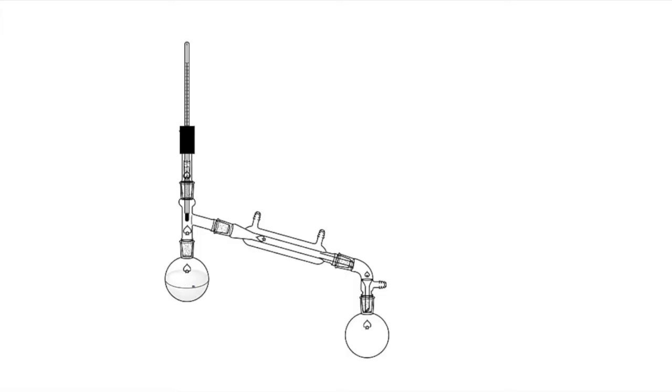So we begin with the liquid here. In our lab, we're going to have a 50-50 mixture of two different organic liquids. And as we start supplying heat to the system, we're going to have particles going up in a distillation, particles in a vapor phase, and then particles also condensing. You're going to start seeing little drops forming here at first, and with continued heat, those particles are going to reach their way up here in the vapor phase. Eventually, they're going to hit the thermometer.